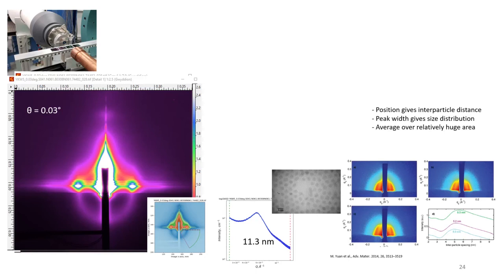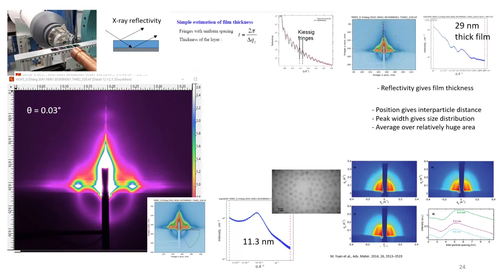And so that's the main thing they're interested in. But also encoded in here is an X-ray reflectivity curve that's embedded in this top part. This is mostly reflection off of the substrate, but there is an interference pattern between the reflection off the top of the film and off the substrate. When they interfere, you get these Kiessig fringes, and you can pull out a film thickness from that part of the image.